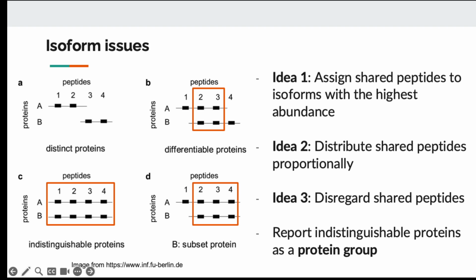So these proteins share the same exon, and based on the peptide that we can see, there's no way to tell them apart. But still, we don't want to throw out all the signal, all the data. So we will report this protein as a group, and we consider the shared peptide as the intensity for the whole group. But we don't know which protein exactly are expressed.